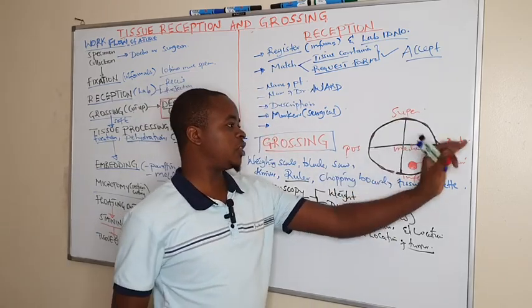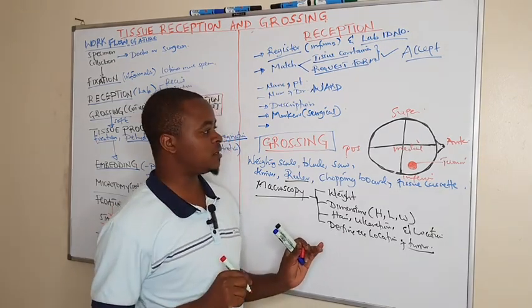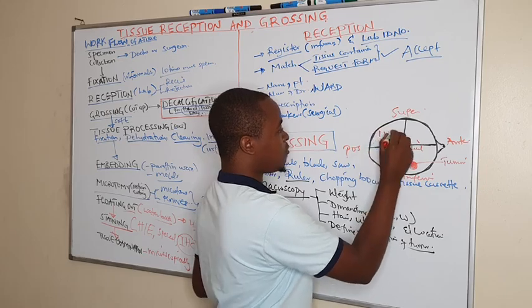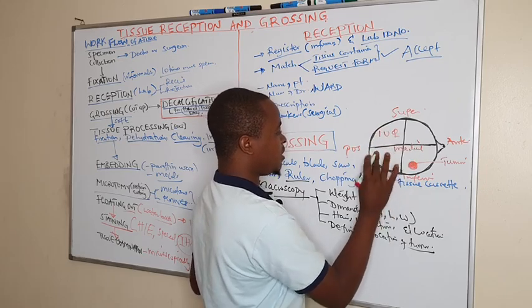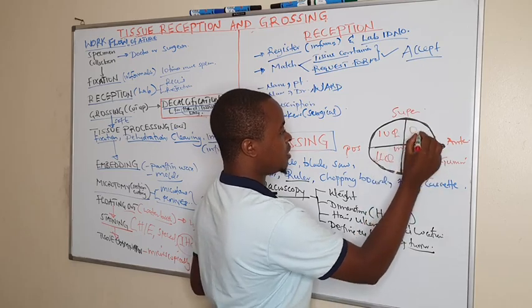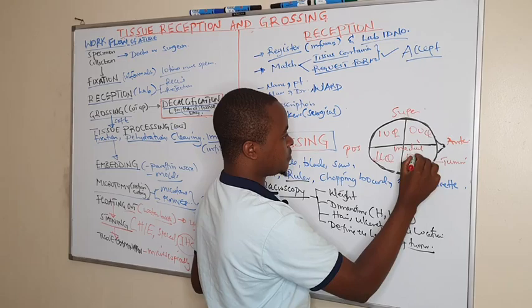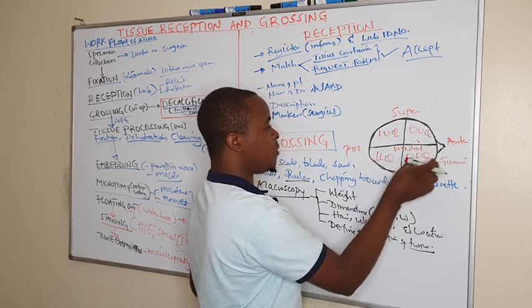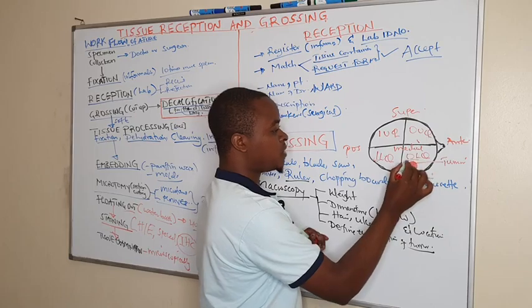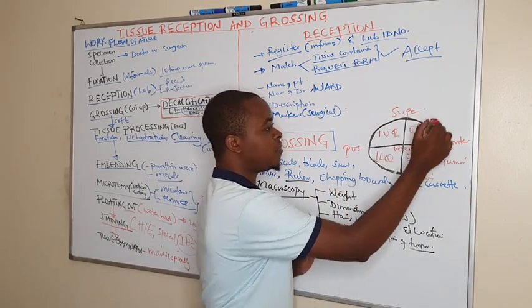So after describing the locations where you want to sample, you sample as you put in the tissue cassette. Afterwards, maybe this is the inner upper quadrant, this is the inner lower quadrant, and this is maybe the outer upper quadrant and the outer lower quadrant. So here we are trying to describe the location, and we shall find the location of the tumor is in the outer lower quadrant of our tissue. And we are taking an example if this tissue was a breast tissue.